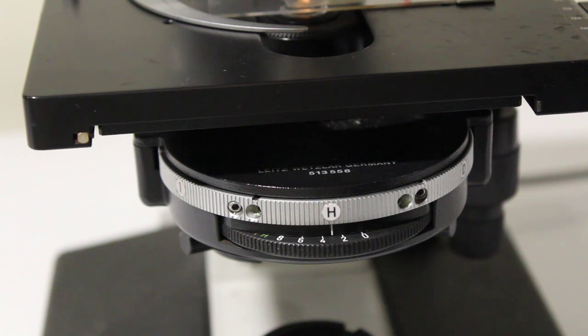Next up is the condenser. As with the field diaphragm not all microscopes will have one of these. That said, it's going to be very hard to do much with yeast or other microorganisms if you don't have a condenser and without a condenser you really can't do anything with bacteria. My advice would be to ensure that your scope has an Abbe condenser which for microbiological work is good enough for 99% of what you need to do.